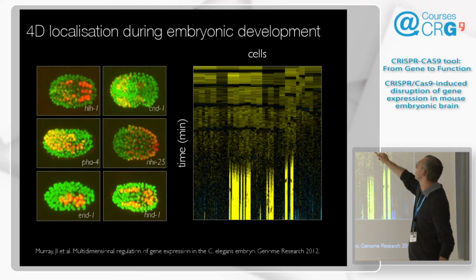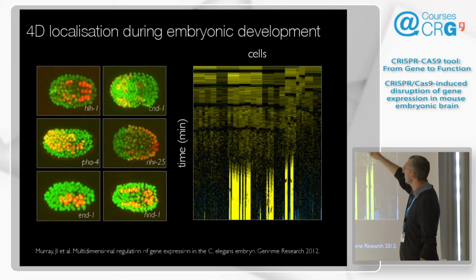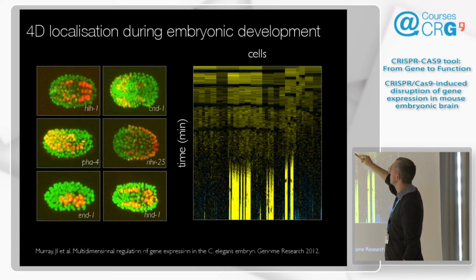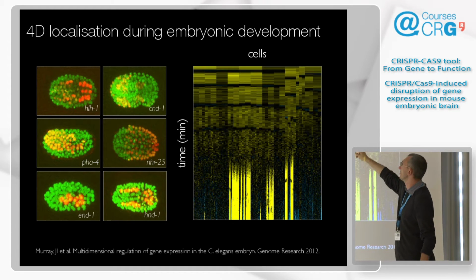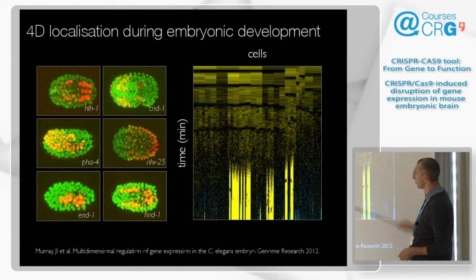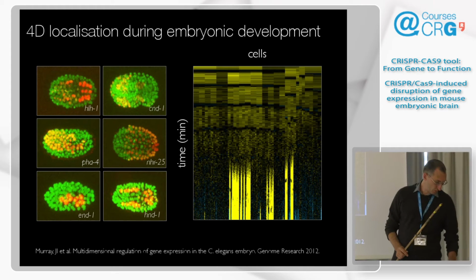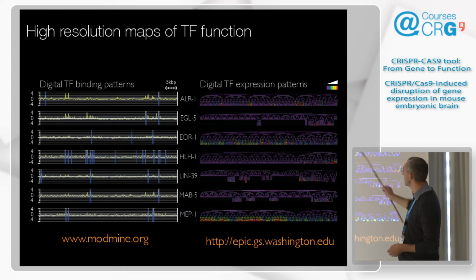You see initially there's 1, 2, 3, 4, several cells, right? And then each of them divides. There's one cell division, there's another cell division, and then there's 2, and then there's 4, and so on. So by that, we can follow them, and also we can be quantitative. So we get this type of representation. We could also plot it as lineage maps.